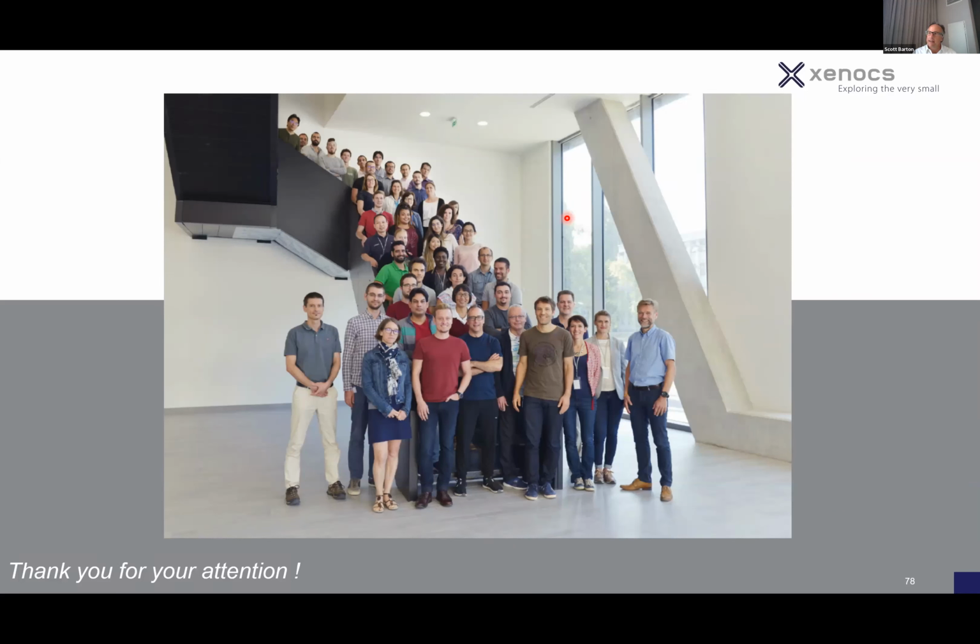Yeah, it is, and most people get introduced that way. I encourage people, if they don't have a system in-house, find somebody who does, or go to a synchrotron. Synchrotrons are amazing places, because even if you have a vanilla flavored sample, and you've never done it before, some of the places, I'm thinking about NSLS2, are really great about taking people under their wing. I just had a conversation today with a synthetic organic chemist who hadn't done scattering before. They went to NSLS2, and now they are totally addicted to scattering.